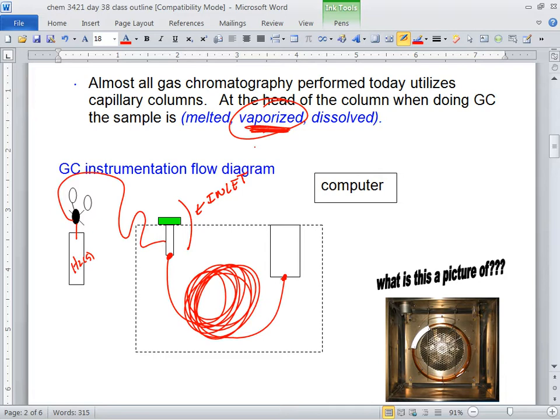So the inlet, you assume, does its job, while the mobile phase container does its job. It supplies the mobile phase, and then it comes over, connected to the inlet. The inlet vaporizes what you injected, and then it shoots everything down into the column. The column better do its job. And its job is to, what? Purify? Well, kind of, yeah.